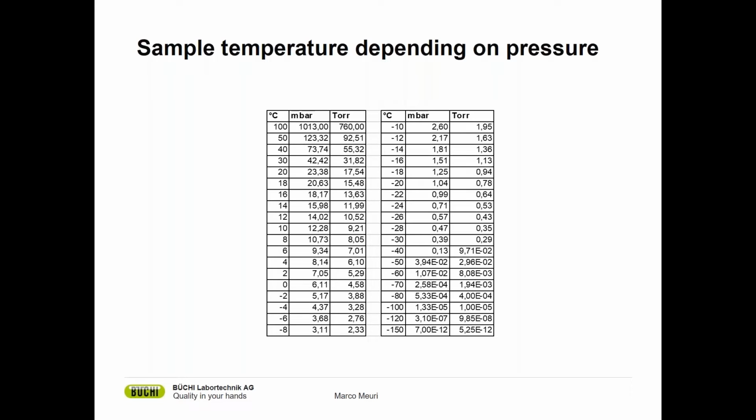So that's why for aqueous samples, typically a freeze drying pressure of about 0.7, 0.6 millibars, a bit depending on the freezing temperature of the sample, is used. Like that, you can make sure you have enough temperature difference and you will freeze dry quick enough.